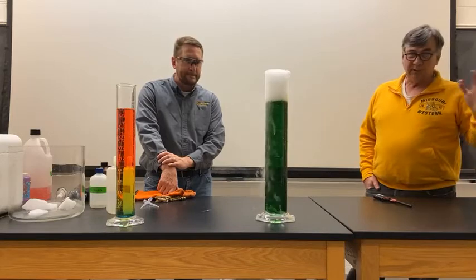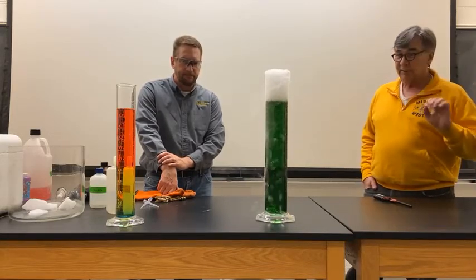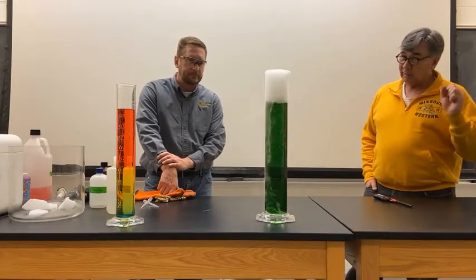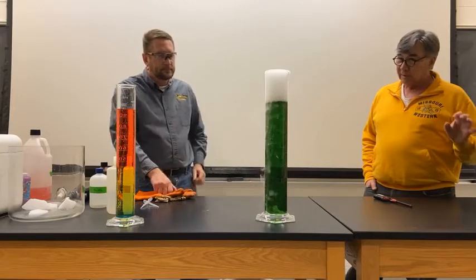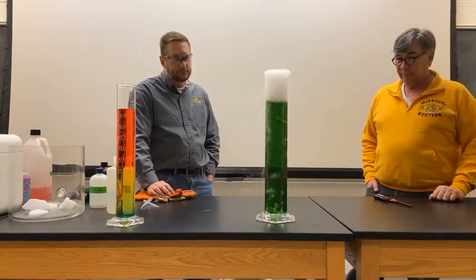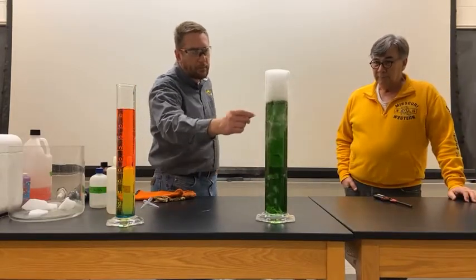As we get more and more acidic, the numbers go down. So if you remember basic chemistry, a low pH is acidic. So when we talk about acid rain, we're talking about low pH, numbers that are less than 7. The 7's neutral. Okay, so now you can start to see the yellowing of this.